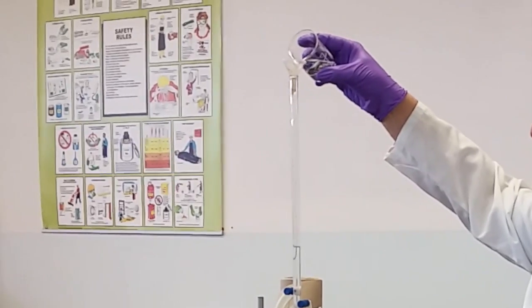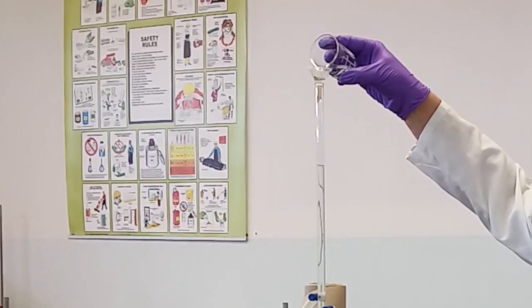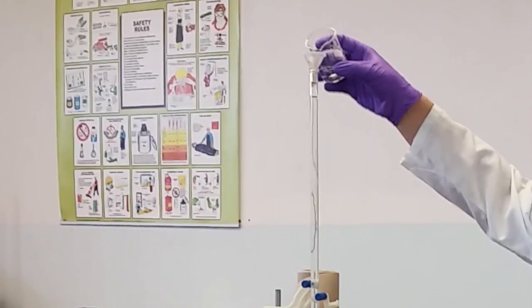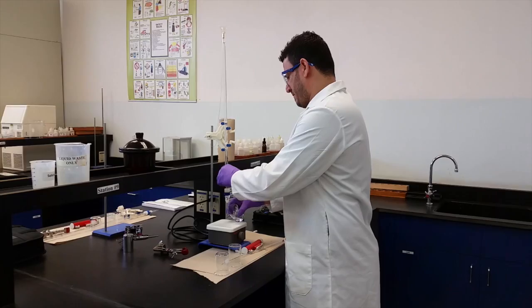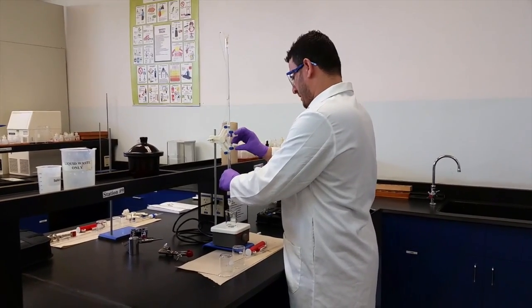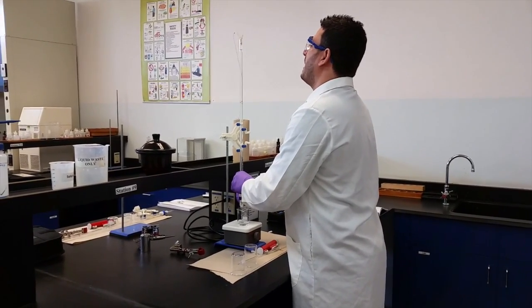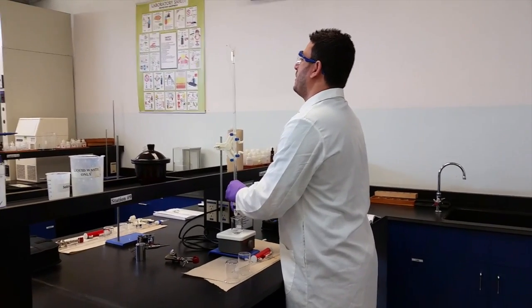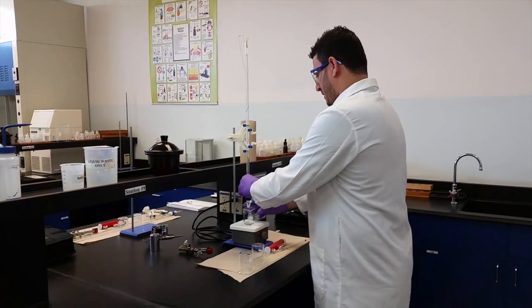Now when you fill it, you fill a little bit more than 0. A little bit more than the 0 mark. And then you can just calibrate your burette to the 0 level. Now you should remember that the bottom of the meniscus has to be at the 0, okay? Okay, excellent.